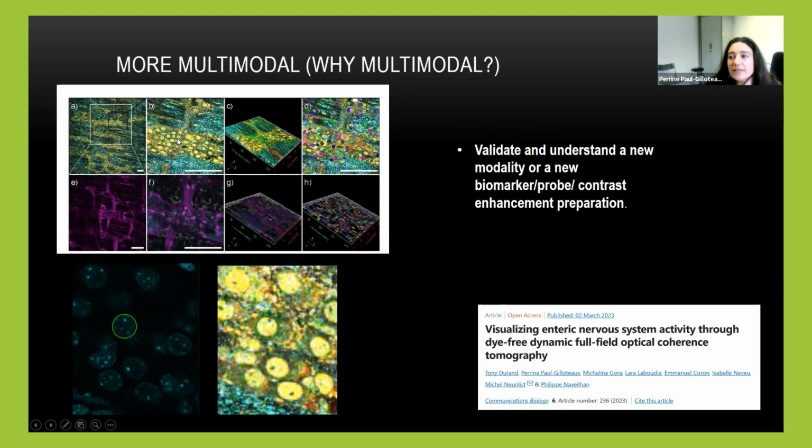And in this modality, which is basically a stainless modality based on vibrational optical coherence tomography, a lot of things can be seen, but the question was, okay, what is seen exactly? For this, we prepared correlative workflows with confocal imaging, using also an intermediate low mag image to do the registration. So everything is in 3D here.